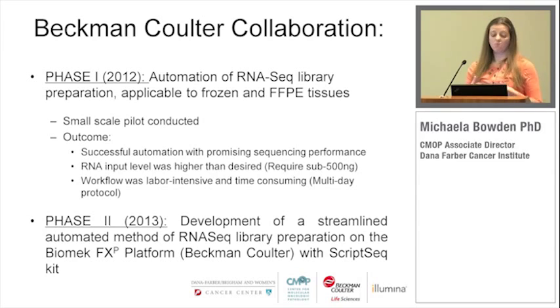And so this is what most of this talk is about today, the phase 2 work, which is developing a more streamlined process, something that's quicker, that has lower input levels, and that we can start to pilot this year to get this translated more into a clinical setting. Because the clinic won't take it, even if the data looks great, if they can't do it on thousands of samples in a very short turnaround time.